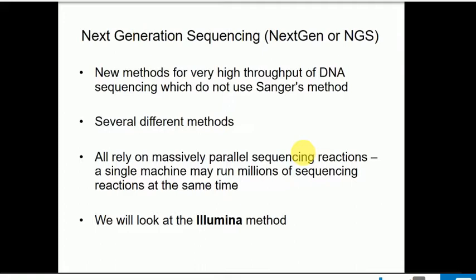There are several methods for doing this. What I'm going to talk about is probably the method that's mostly used, which is the Illumina method, and we'll get onto another method later on. This is not the only one, but it's the one that's become sort of the industry standard.